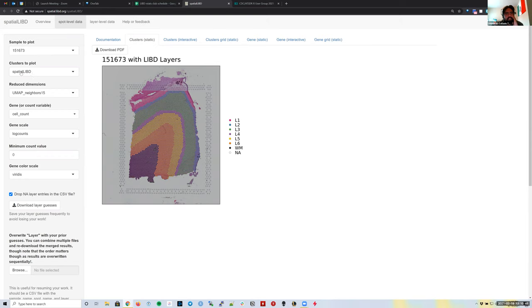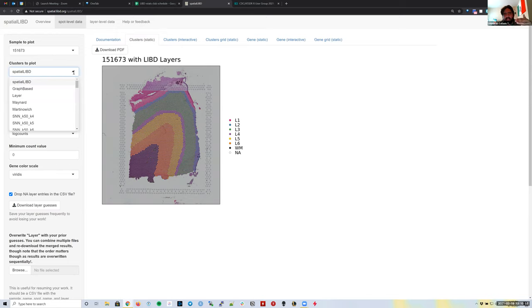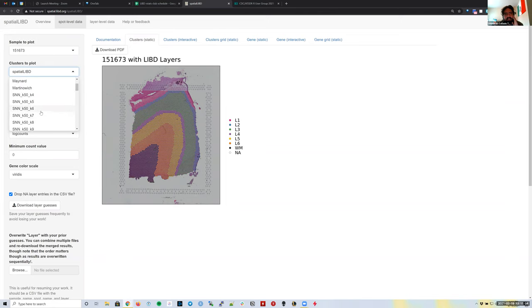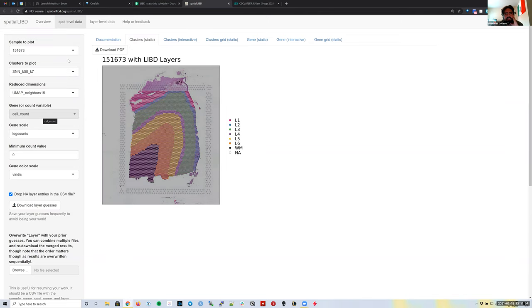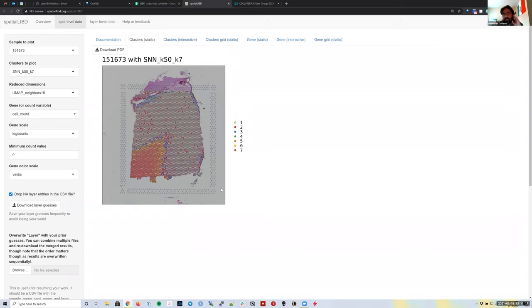What it's showing now is the layers that Kristen Maynard manually assigned to every spot. We could also look at other clustering results — for example, a graph-based cluster result using seven clusters. The idea of this website is that it helps many people make these plots without having to ask anyone to open the data in R or write plotting code for them.